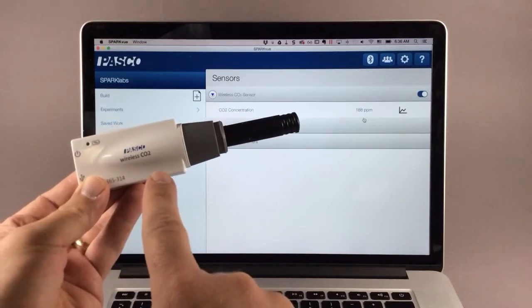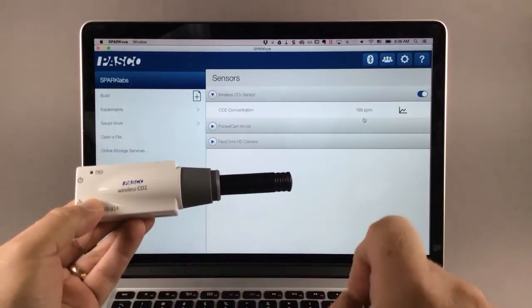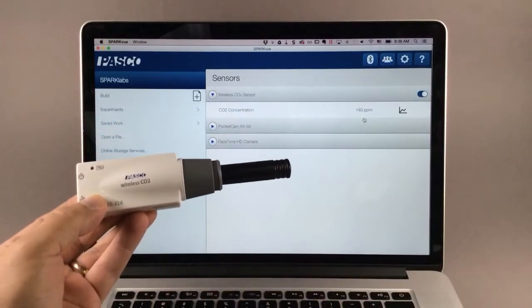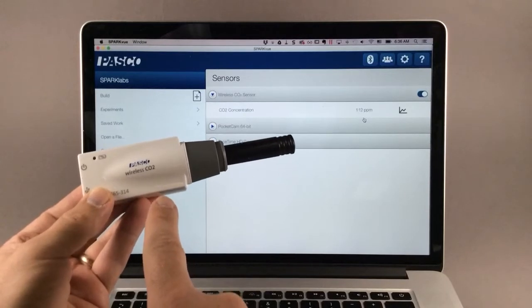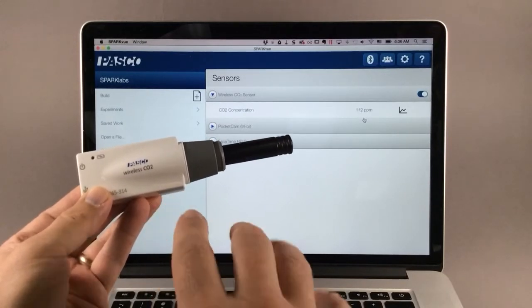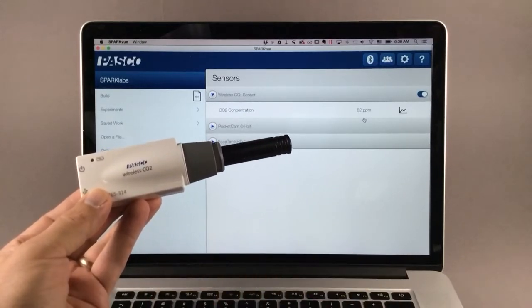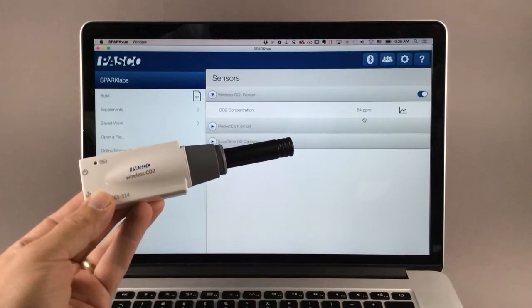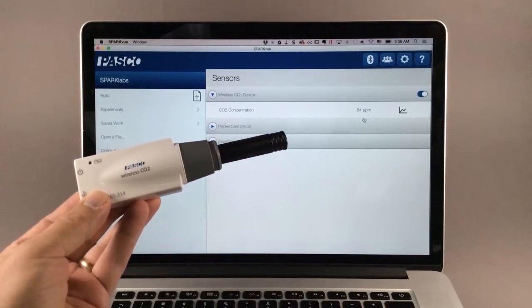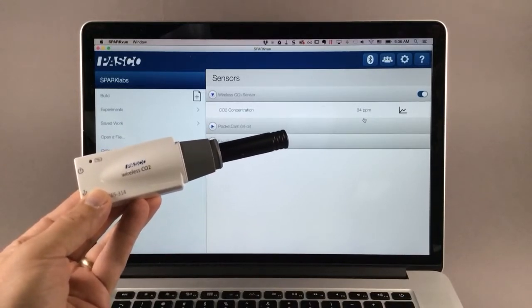How do I calibrate the wireless CO2 sensor in SparkView software? If you find that your wireless CO2 sensor is reading outside the range of about 300 to 500 parts per million in fresh air, you can calibrate it using fresh air to read 400 parts per million.